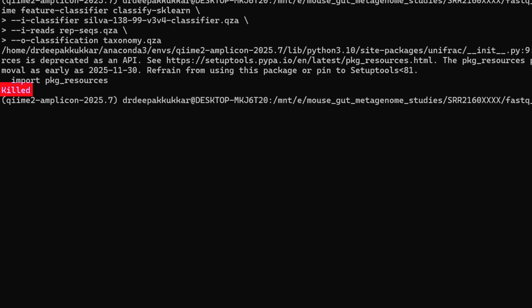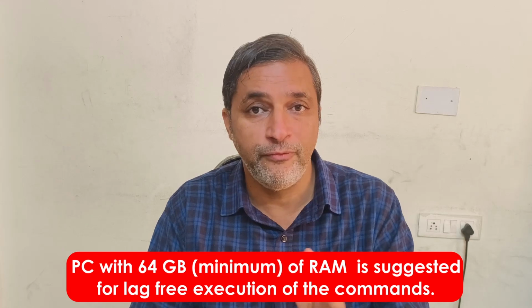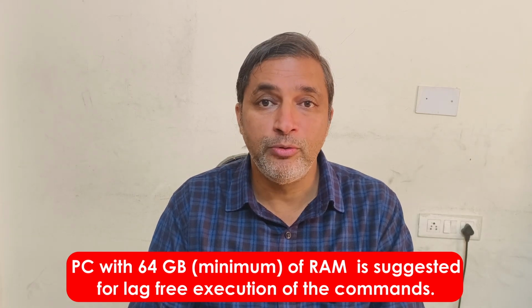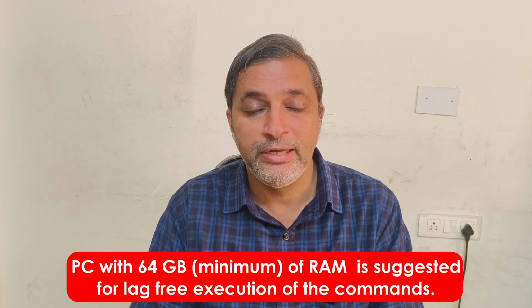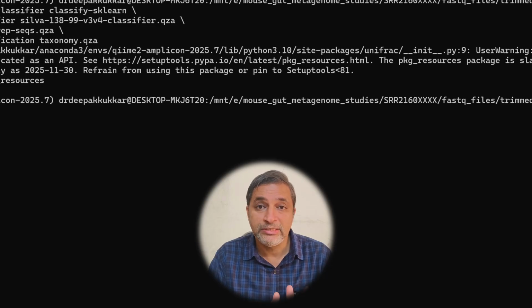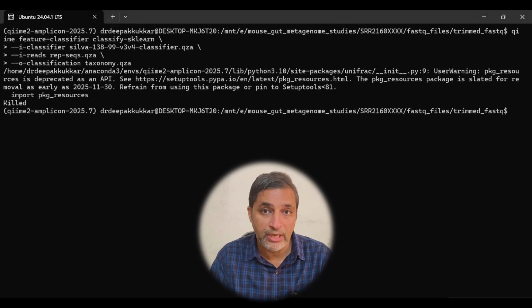Personally, we have faced a lot of issues. So what I suggest is that you use a powerful workstation with at least 64 GB of RAM. Besides, if you are using WSL, or Windows Subsystem for Linux, or even if you are working in a Linux environment, then your system must have empty space of 100 GB or more.